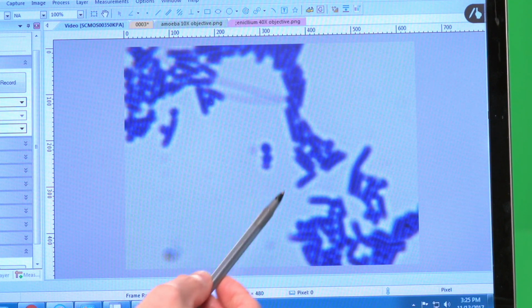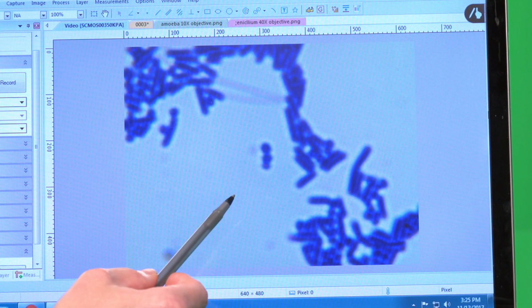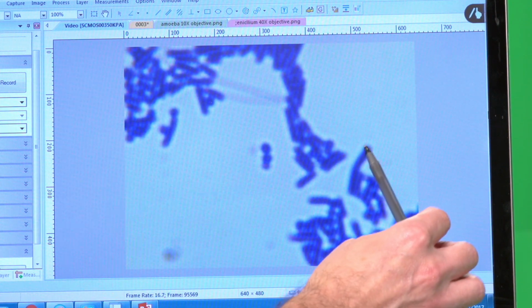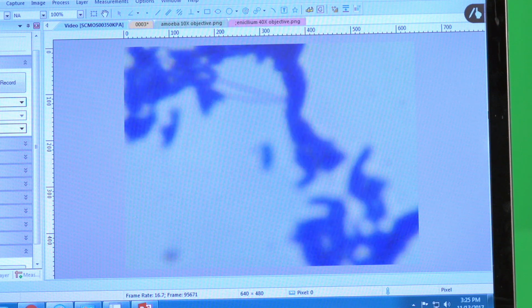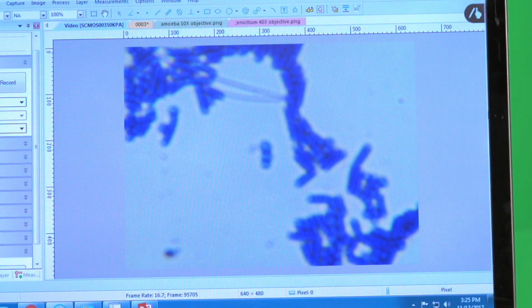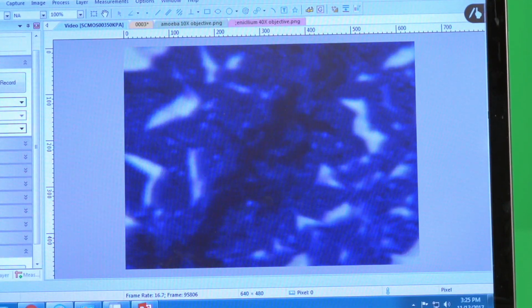All right? So this right here is a mixture of mainly bacillus, so the elongated bacillus, and there are some coccus mixed in. And that's what will happen sometimes when you have not a really, really pure sample. So I'm just going to go ahead and move this to another zone to see if we can see some individual cells a little bit better.